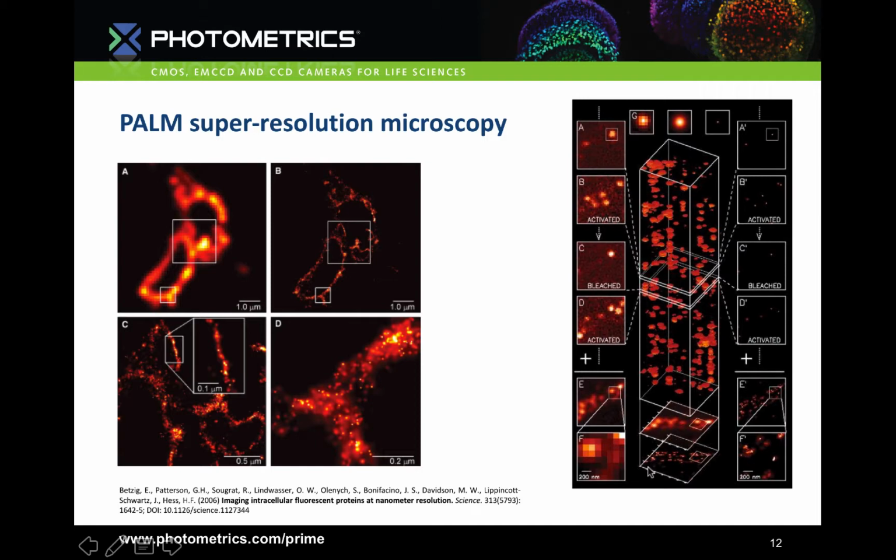It's pretty slow, and when they did this work back in 2006 it took 2 to 12 hours to acquire a single image. Since then there have been large improvements in the quality of fluorescent molecules and other advances to speed the process up.